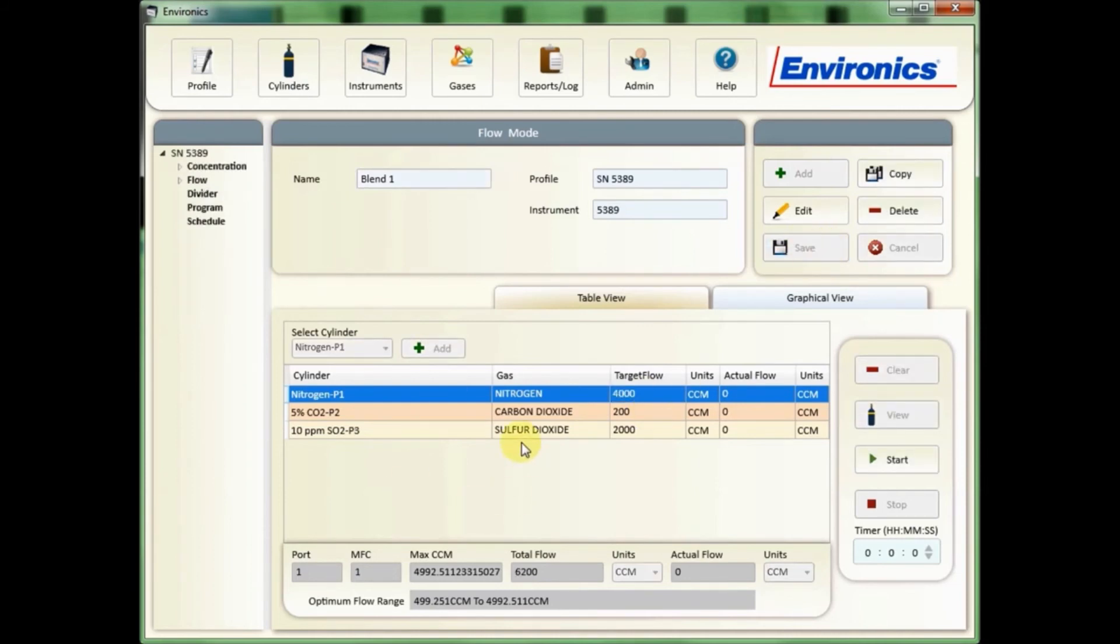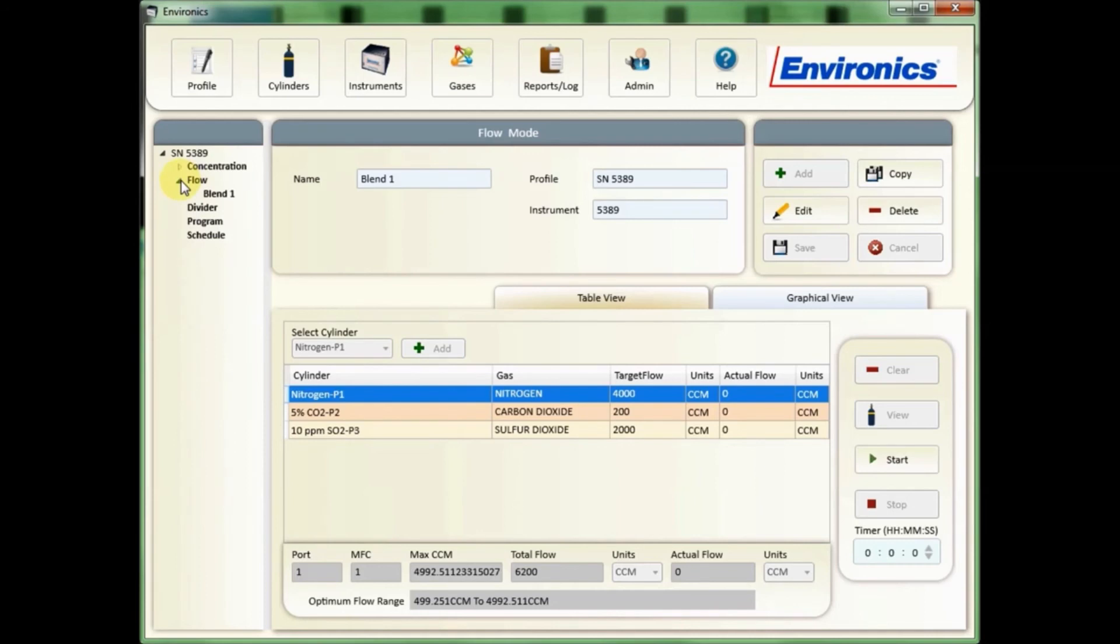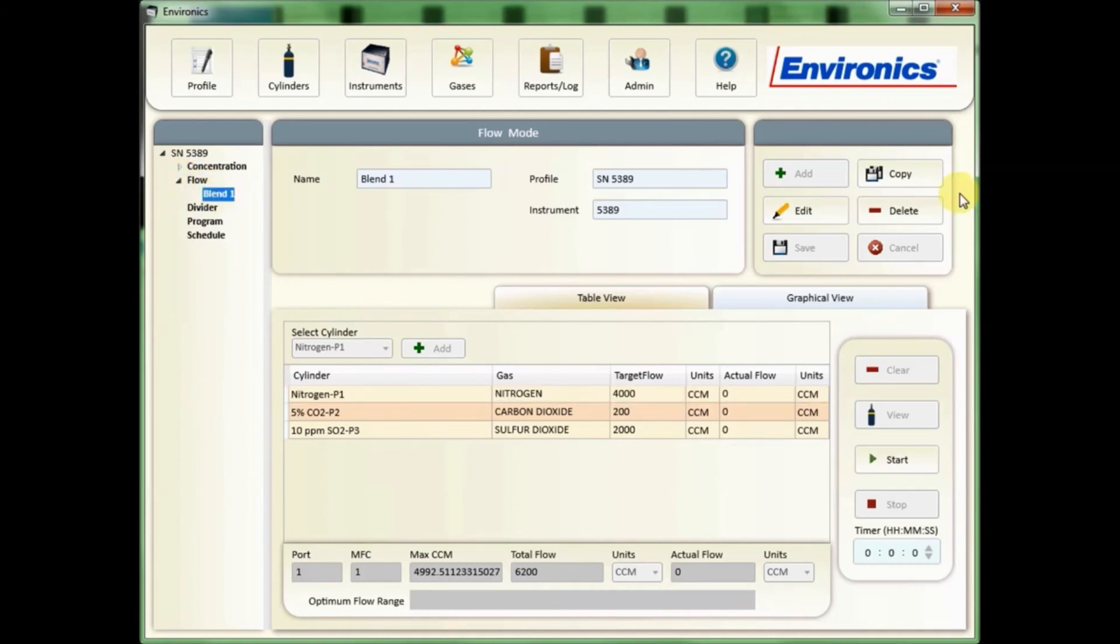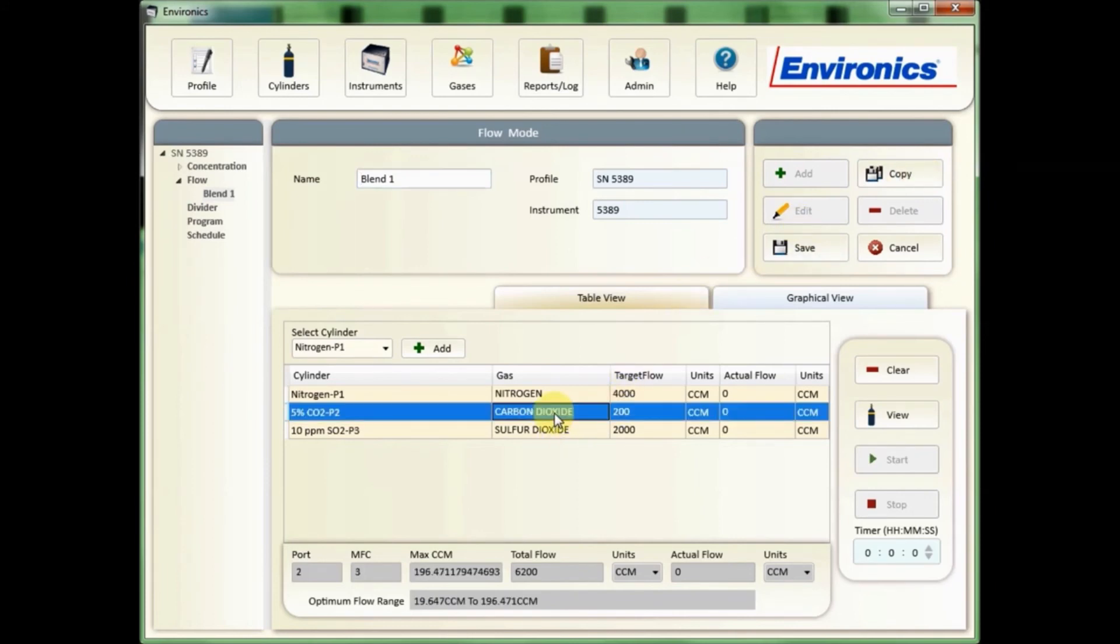If you want to copy - say I need to make a very similar flow mode to this - select the mode that I want to copy, click the copy button. For example, let's say I want the same thing but without any carbon dioxide. I would simply clear that line that I've selected and save, noting that duplicate names are not allowed. Give it a new name and click save.